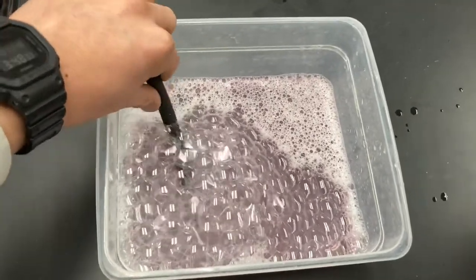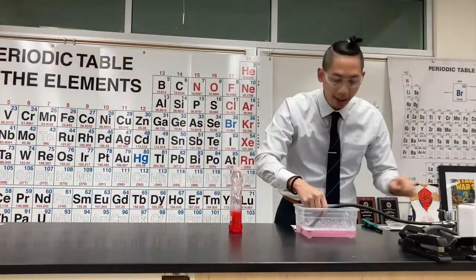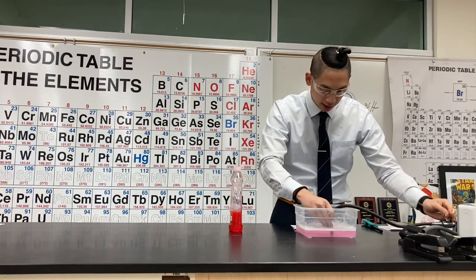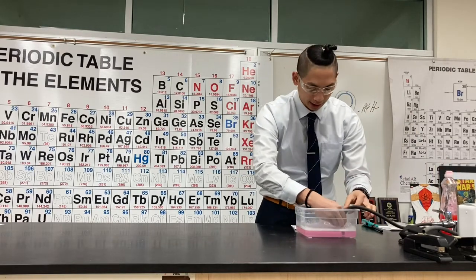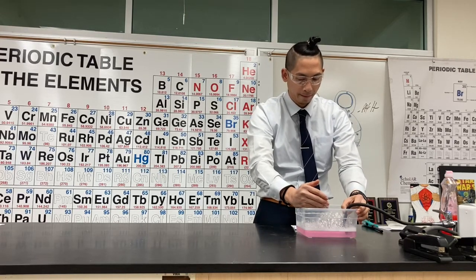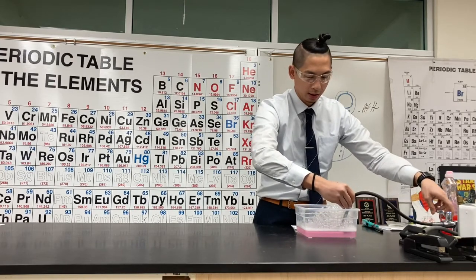All right, stay tuned. It's gonna happen pretty soon. So again, soapy water, and I'm gonna make some gas bubbles, and then I'll be able to ignite these gas bubbles. So give me a second here. Just want to form enough bubbles. All right, let's try this out.